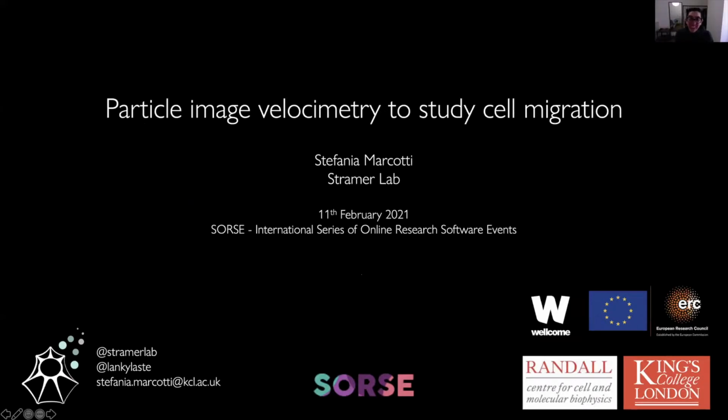Yes. Great. So thank you all for being here. Thank you for the introduction, and thank you to the organizer for allowing me to present this work. As Jeremy said, I'm going to give a short intro, about 10 minutes with slides, just to tell you what the software does. And then I'm going to try a live software demo, hoping that everything will work. Keep your fingers crossed.